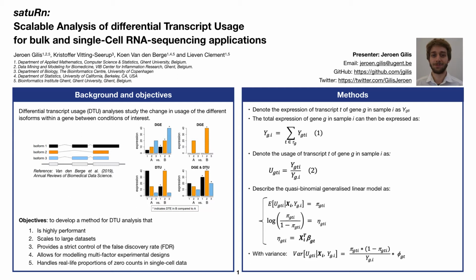I am a PhD student at Ghent University at the Statomics group that is headed by Professor Lieven Clement. Today I will be presenting a novel R software package called satuRn for performing differential transcript usage analyses.